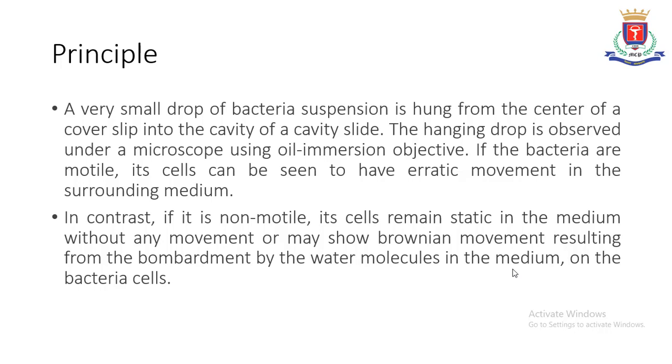So if the bacteria is motile, the cells will be seen to show erratic movement in the surrounding environment, and if the cells are non-motile, then they will remain static in the medium without any movement or may show Brownian motion resulting from the bombardment by the water molecules in the medium on the bacterial cells.